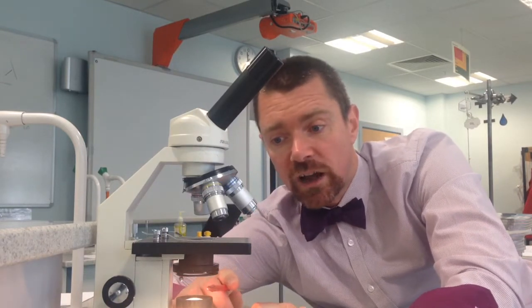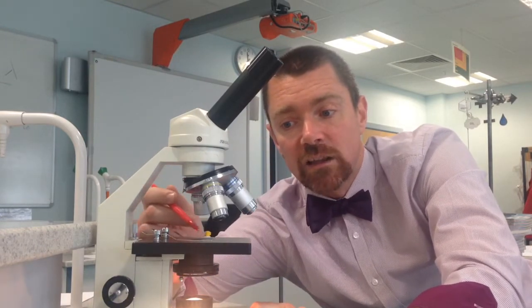And right at the bottom, if you switch it on you'll see there is a light bulb that shines light up through a hole in the stage. Now, how to use the microscope.